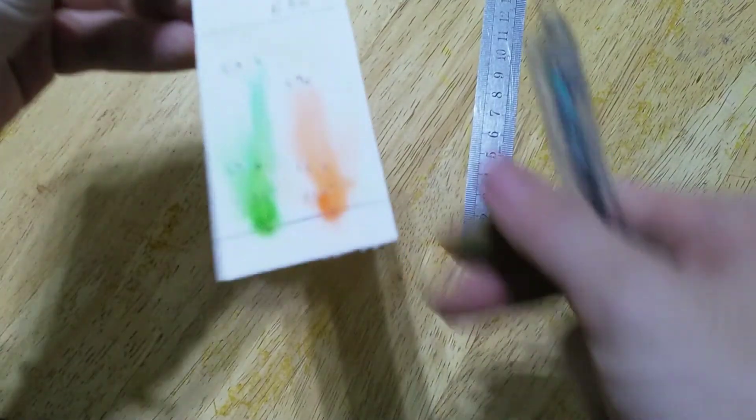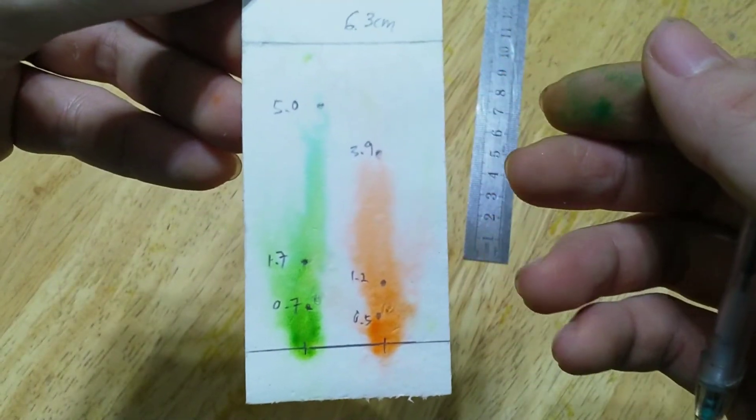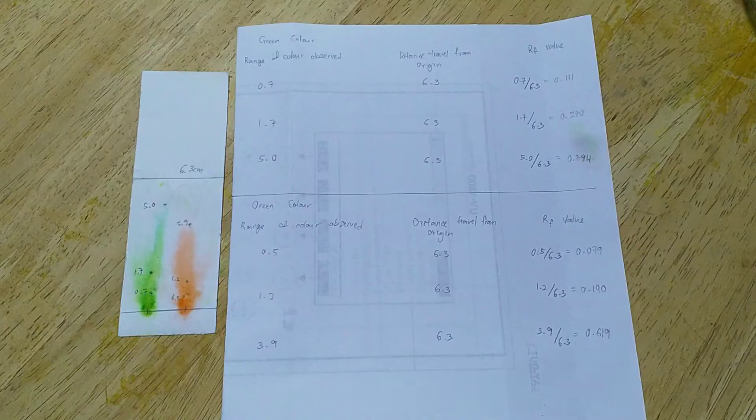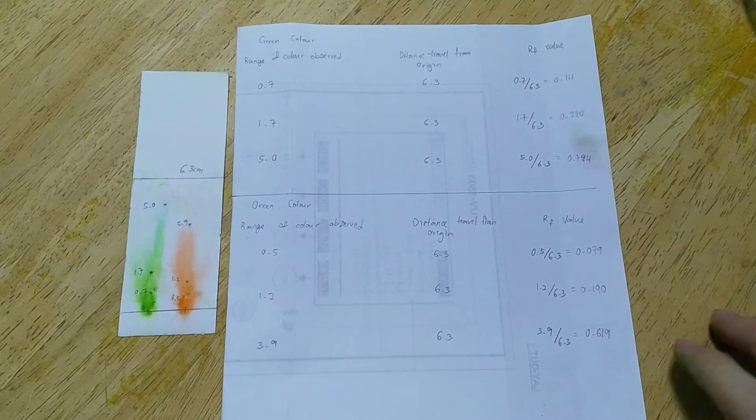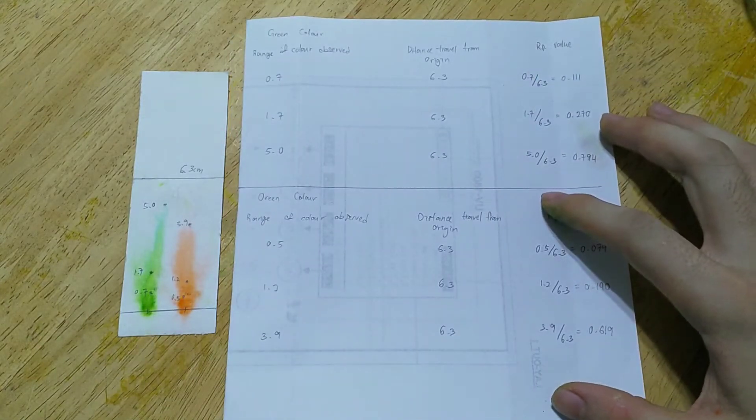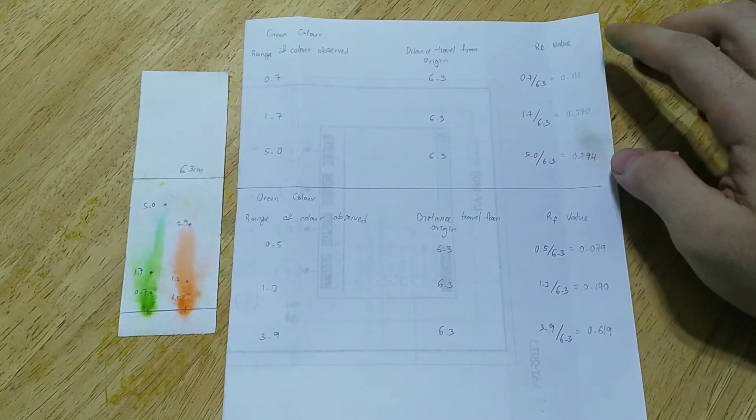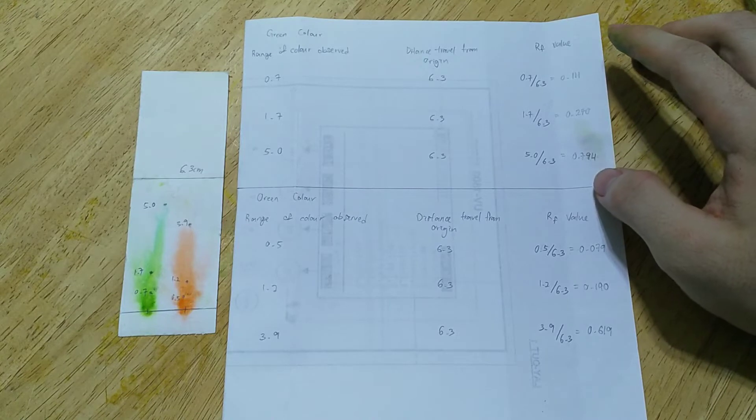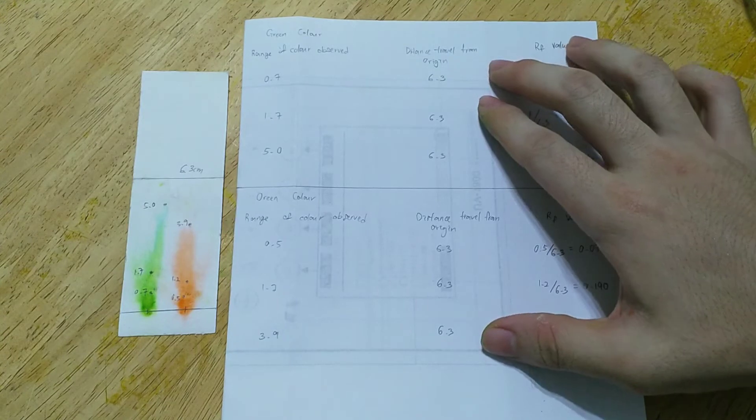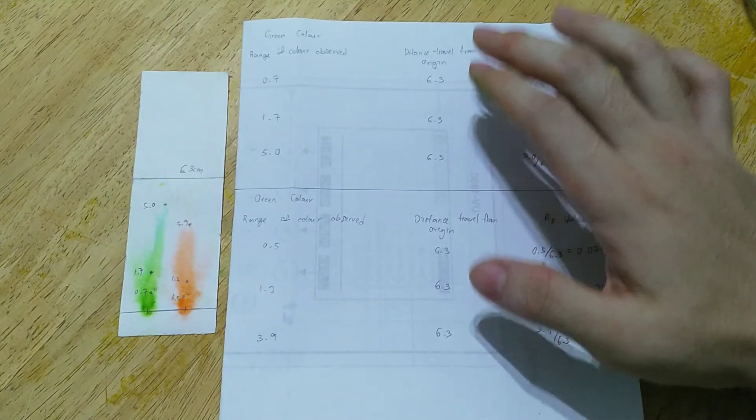And now with all the readings we can more easily calculate the RF value. So let me show you the RF calculation. This is the calculation for the RF value. So this upper part is the green color and the bottom part is the orange color. RF value I don't put the unit since the RF value is the calculation for ratio of the distance. So the distance traveled from origin is the same 6.3cm.